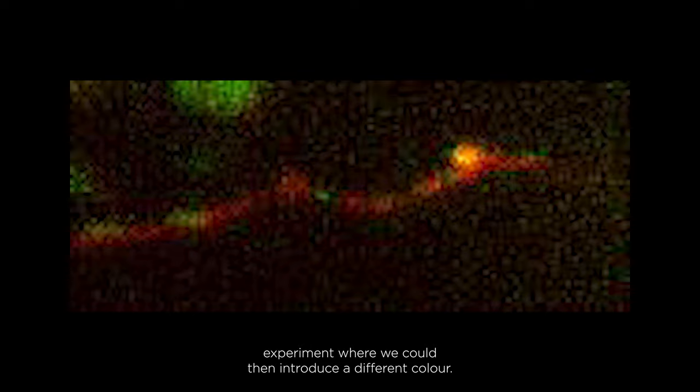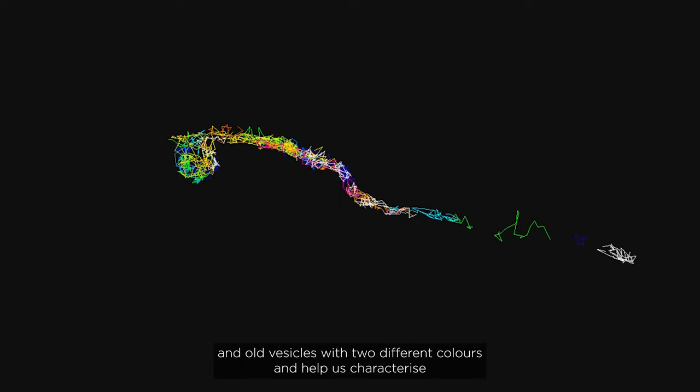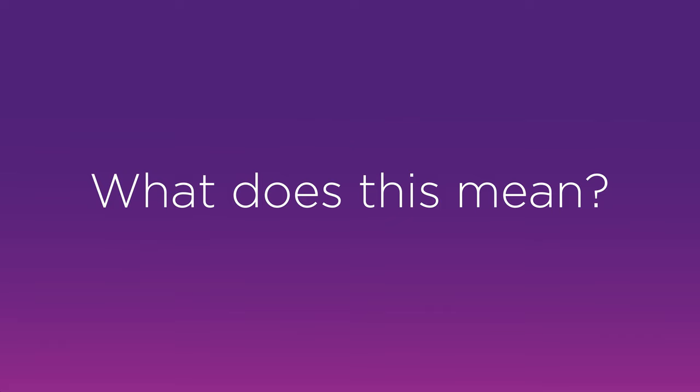Thereafter, we could do a new labeling experiment where we could then introduce a different color, and what this allowed us to do was in the same neuron label new vesicles and old vesicles with two different colors and help us characterize how they move in and out of the presynapses.